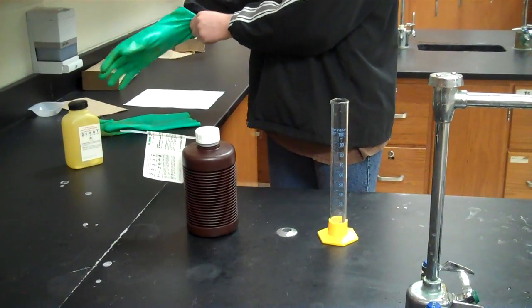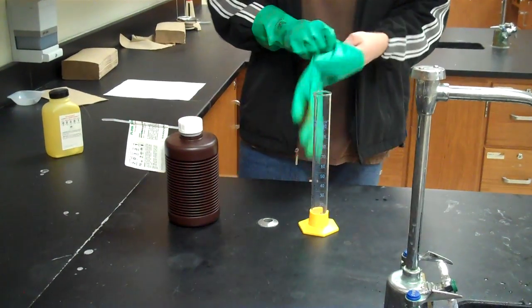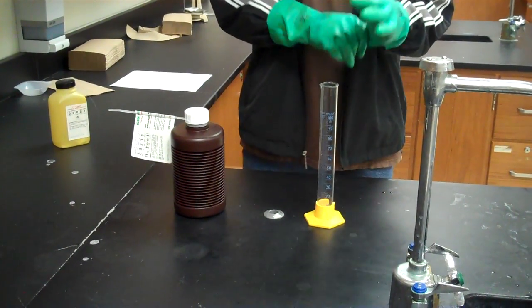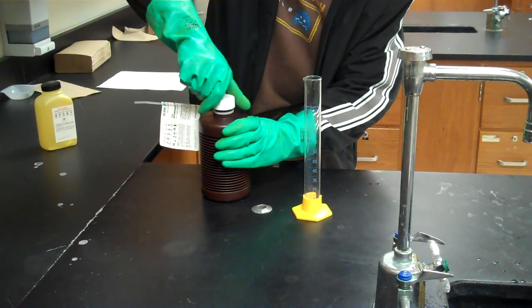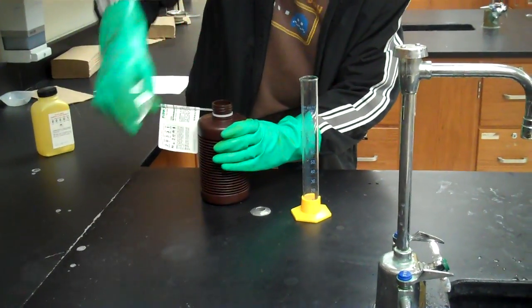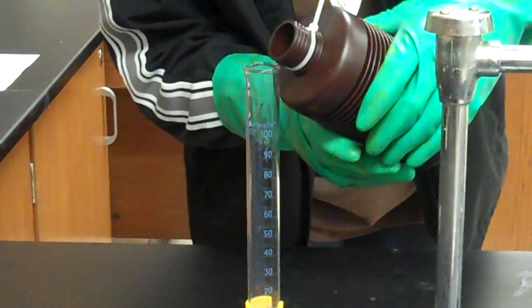He's putting on gloves to operate the 30% hydrogen peroxide. As you see, he will pour 100 milliliters into the graduated cylinder. And you must be very careful, because it is highly reactant with skin.